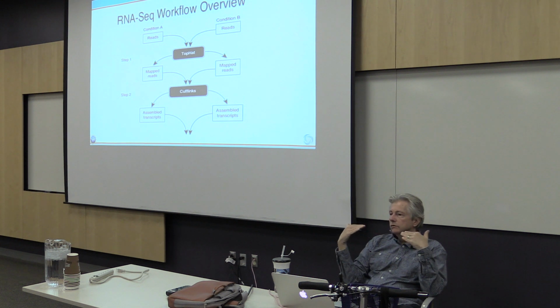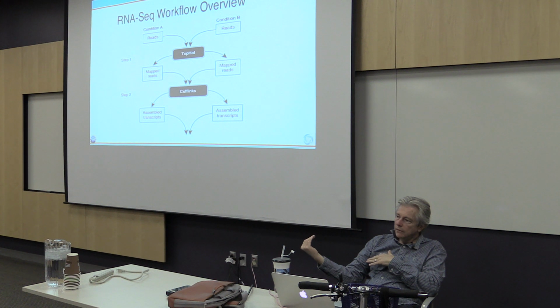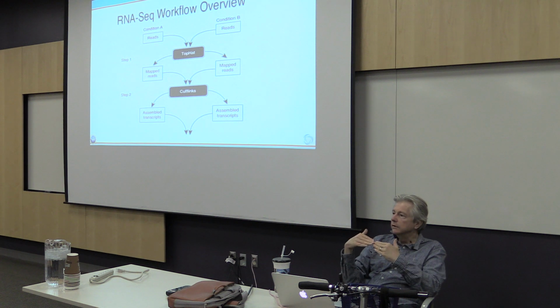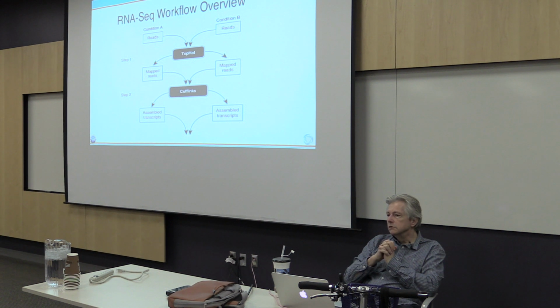Does this look like what's annotated, or does this look like something different? If it's seeing junctions between exons that don't normally come together, if that junction information is solid, it's going to build a new transcript. It doesn't have a choice. It can't throw out those junctions. That's where the junctional information is very important. If you just had random exons, without the junctions, it may not come together so well.